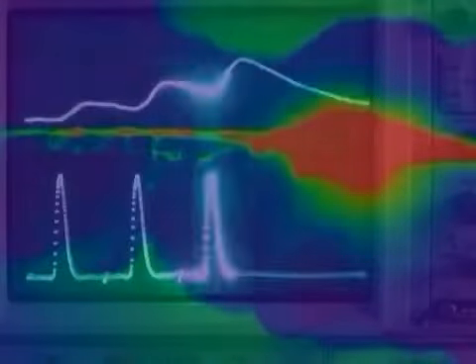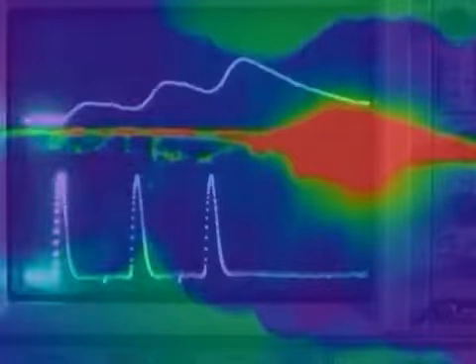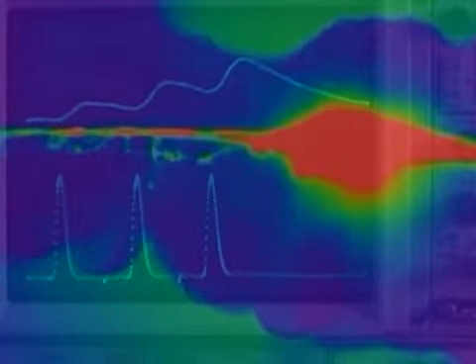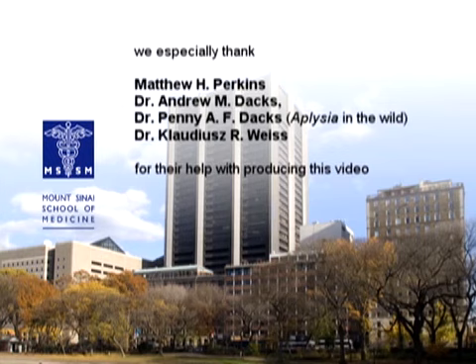In conclusion, we have demonstrated techniques that can be used to simultaneously monitor the intracellular calcium concentration and evaluate the efficacy of synaptic transmission. These techniques require only modest equipment compared to most functional imaging and are easy and quick to learn.